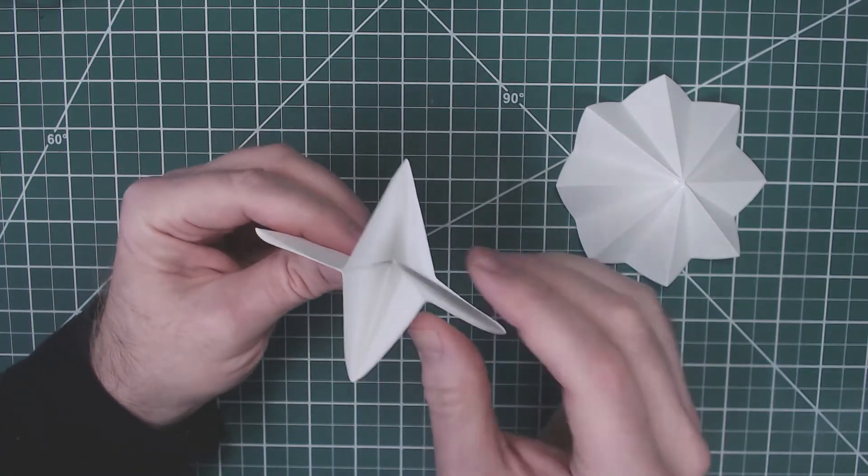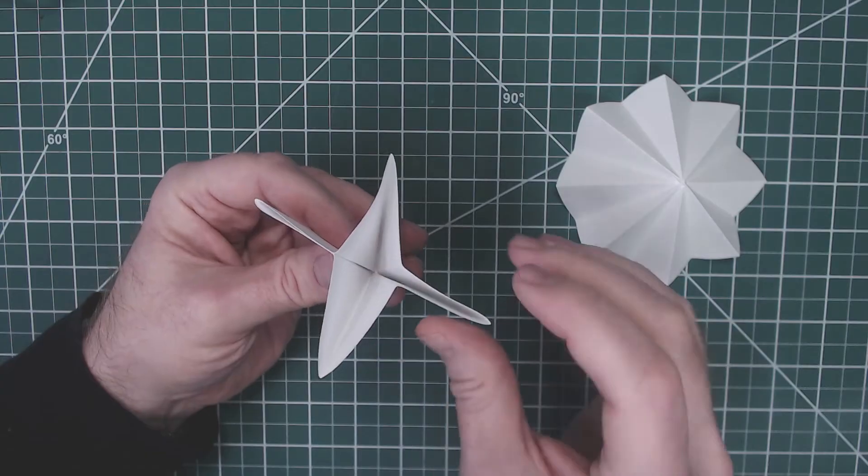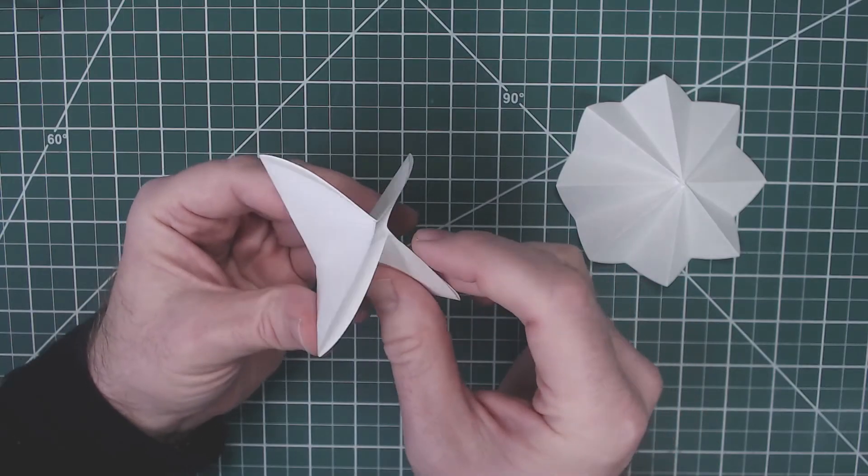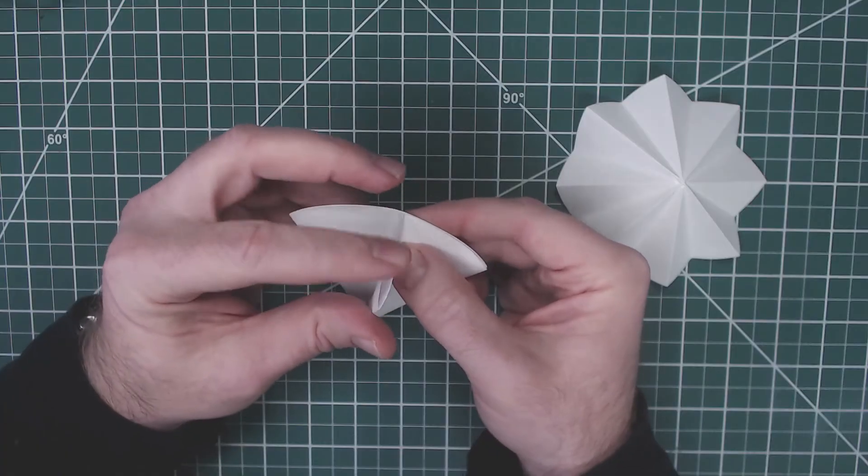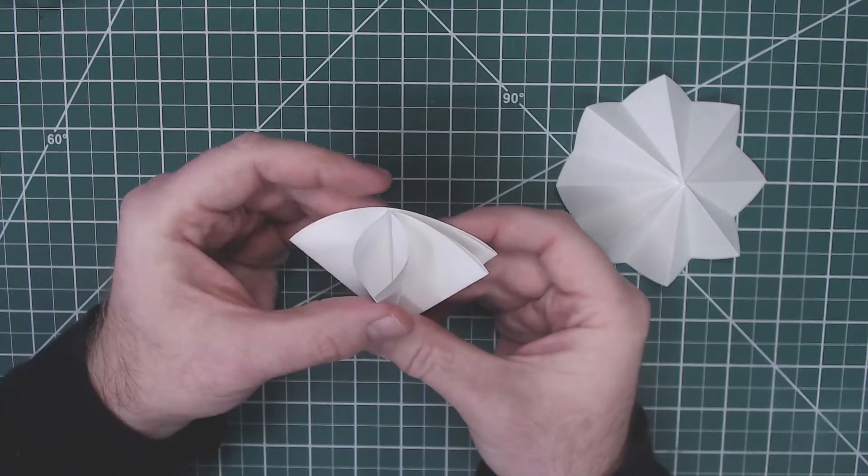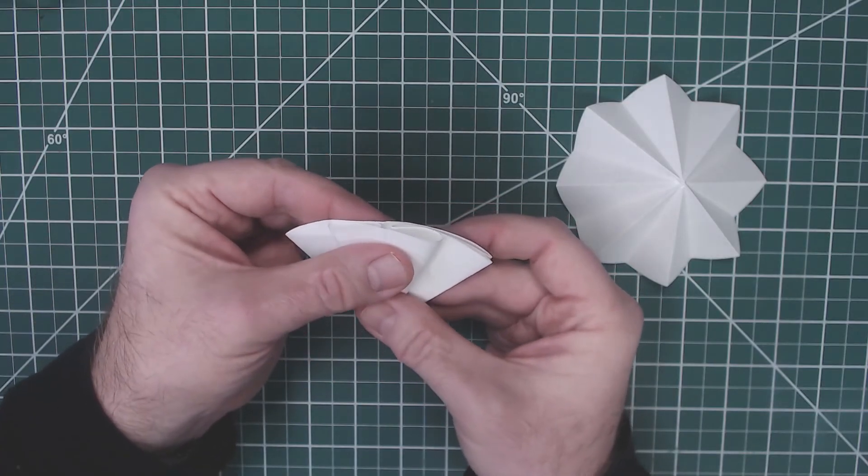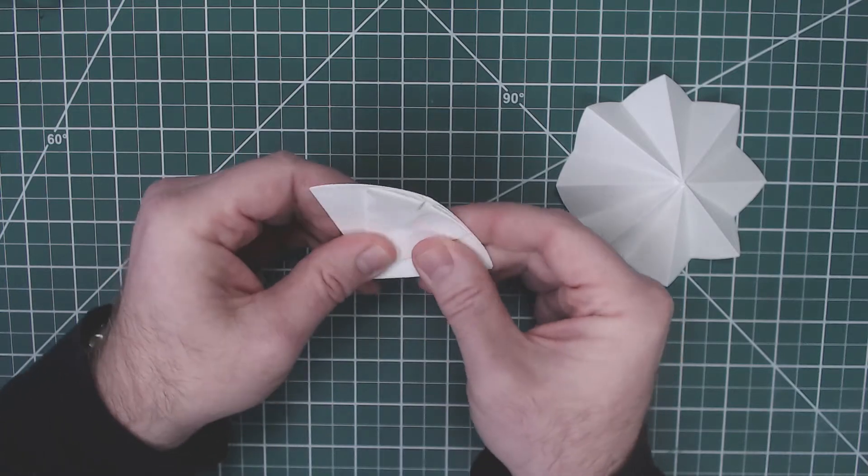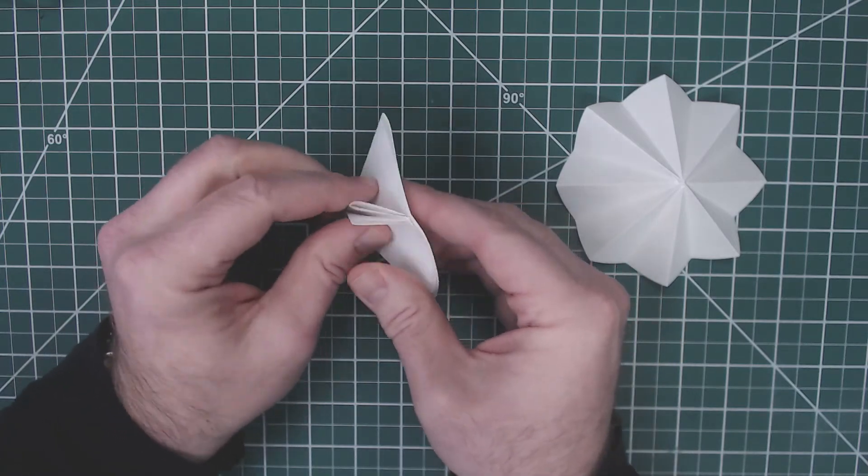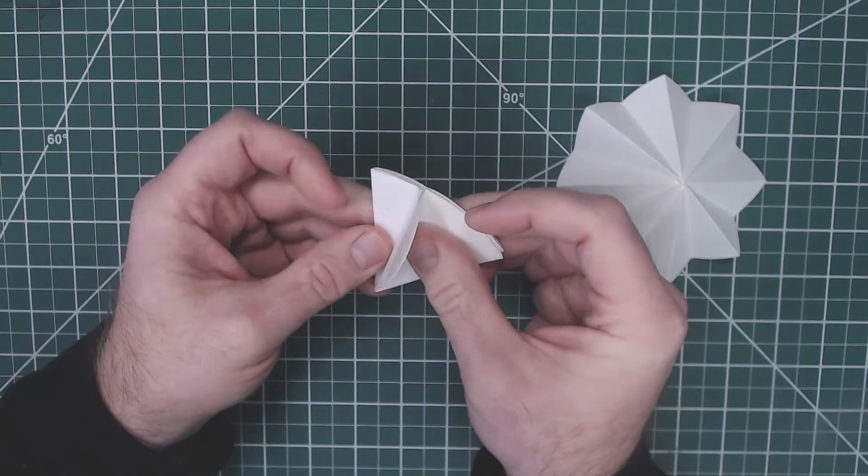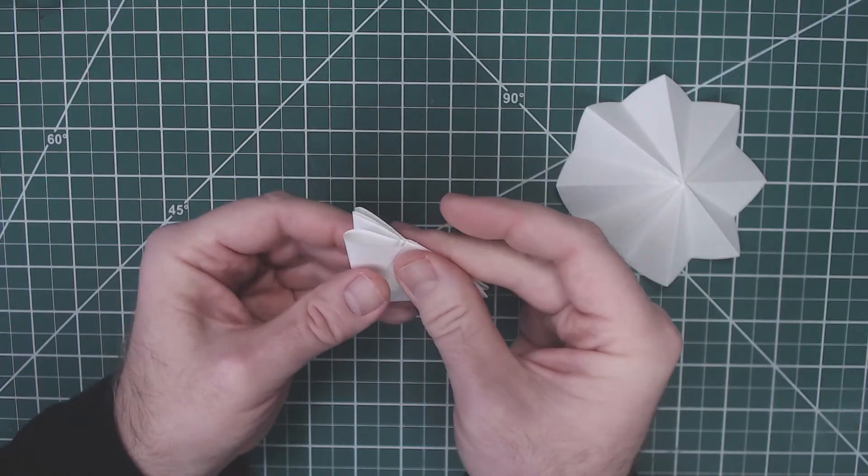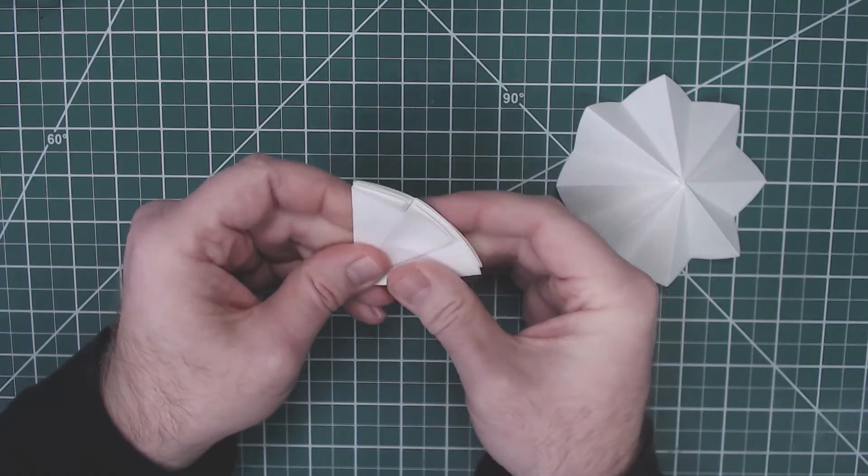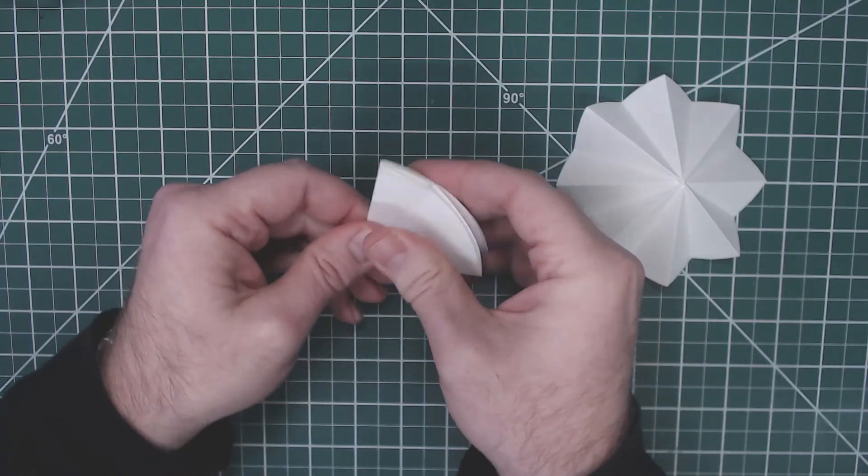Next we're going to take each of these and push them in and fold them again. Take that edge, push it in, fold it, and then fold that back. You'll do that three more times and fold that back.